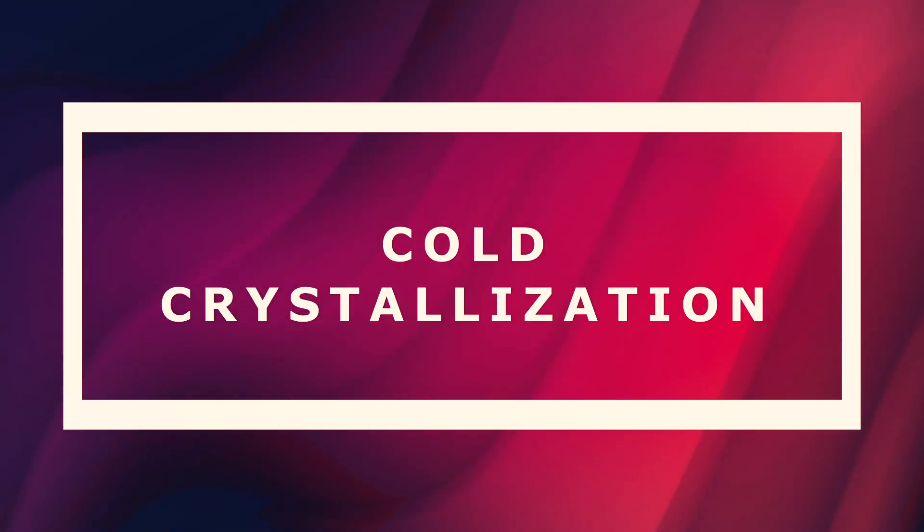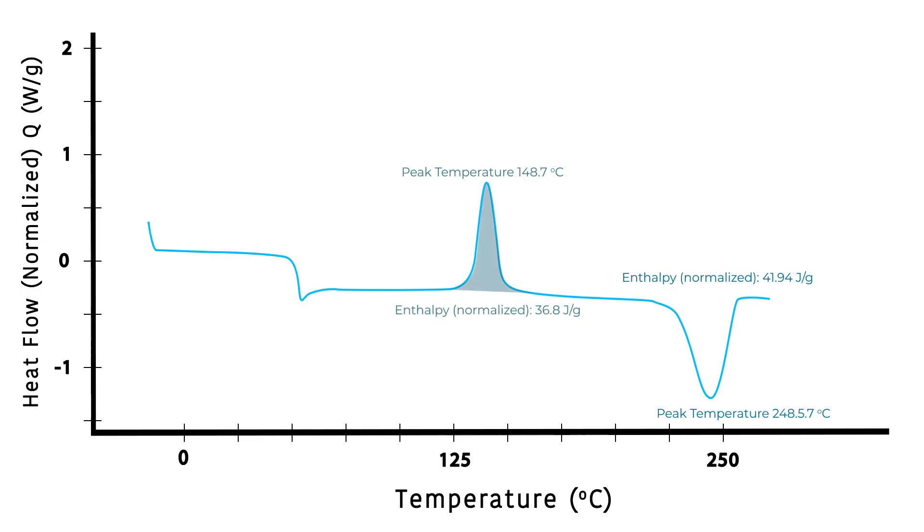At a certain temperature above the glass transition temperature, the polymer chains begin to form an orderly pattern leading to an exothermic reaction releasing energy. This is called the cold crystallization. This can be seen in the heating part of the DSC trace.